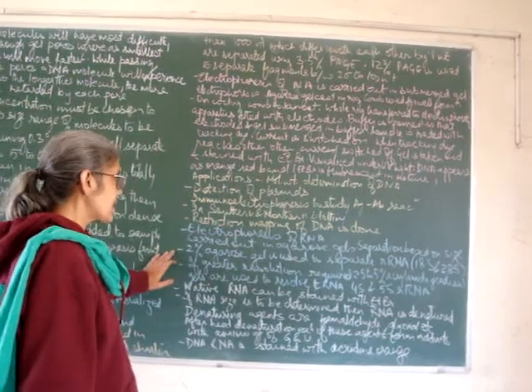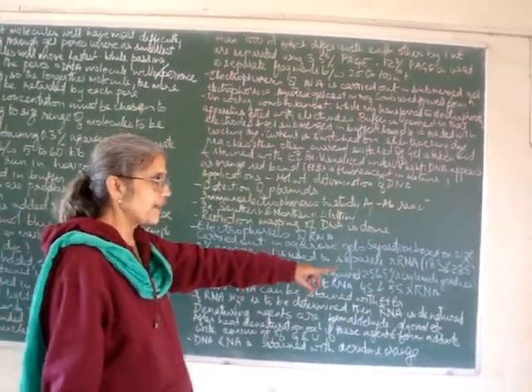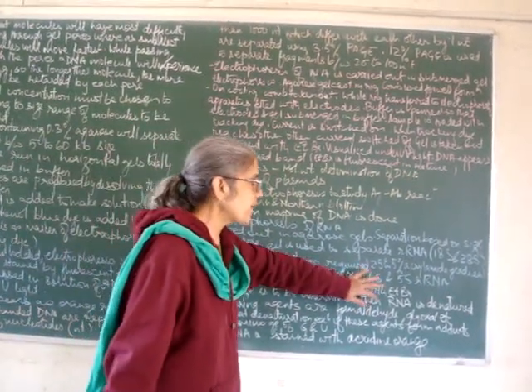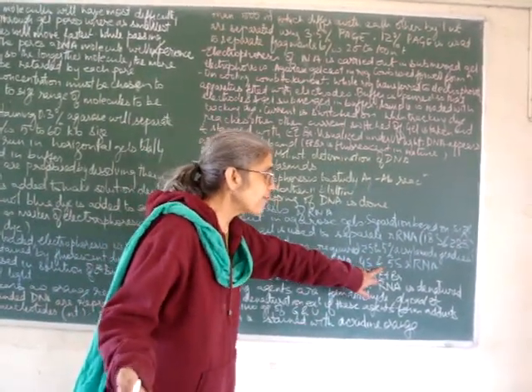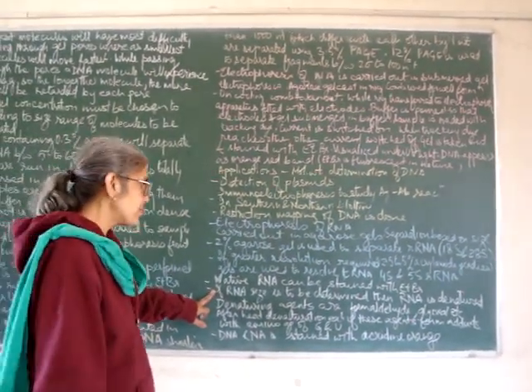Separation is based on size. A 2% agarose gel is used to separate ribosomal RNA 18S and 28S. If greater resolution is required, then 2.5 to 5% acrylamide gradient gels are used to resolve transfer RNA 4S and 5S ribosomal RNA. Native RNA can be stained by ethidium bromide.